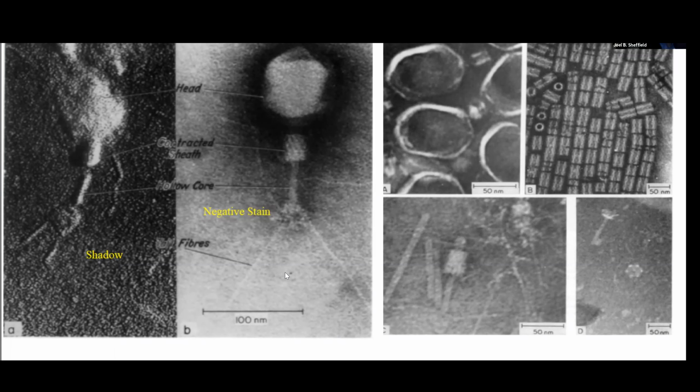Okay. And you can see the extraordinary amount of detail that is revealed by this. A bit of structure of the head, even in these sort of not particularly great electron micrographs, you can still get the sense of the head. You can see how the stain built up along this structure. So this is the stain in the format that I suggested before, forming a kind of a shell over it. So, okay, if this is the head, the stain is kind of grouping up this way.